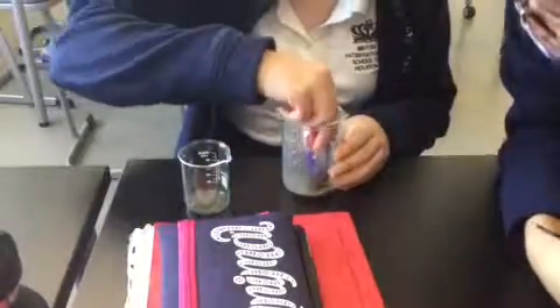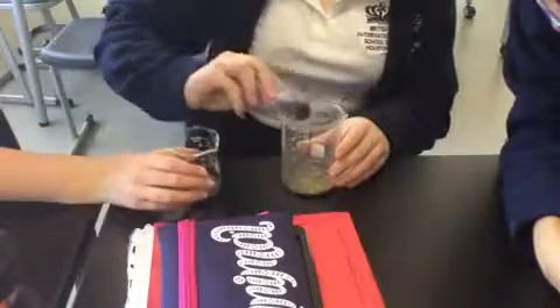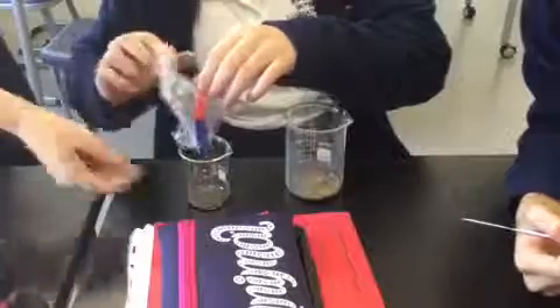Our next step was to separate the sand and the iron filings. To do this, we used a magnet wrapped in cling film. The magnet would pick up the iron filings but left behind the sand. We then moved the iron filings into a separate beaker.